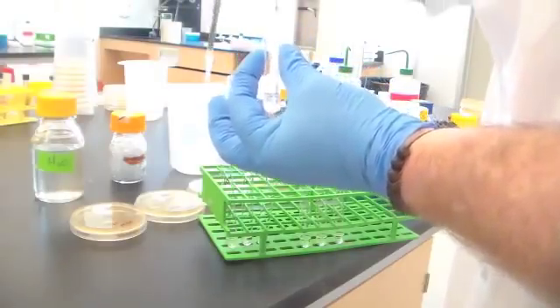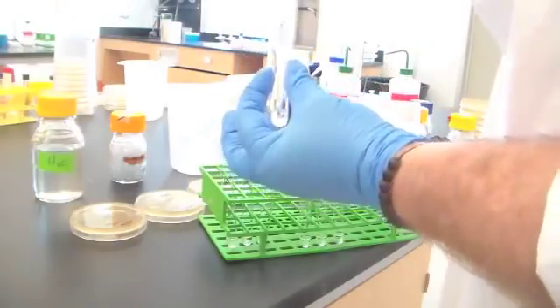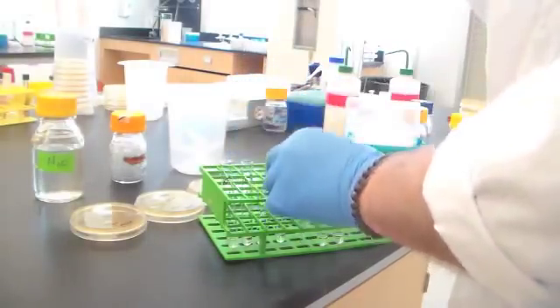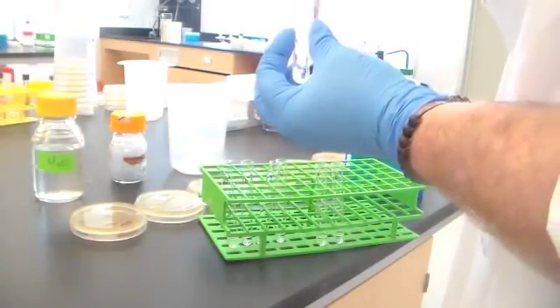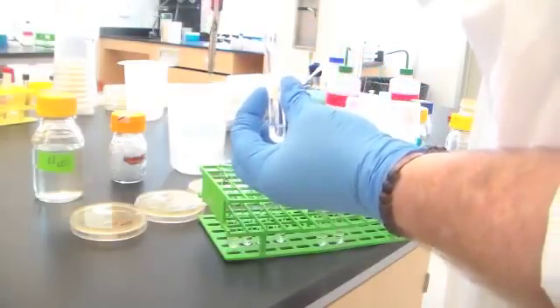There's lots of ways that you can make an error as you're doing this. So it's important to stay focused. Even as I'm talking to you right now, I'm beginning to think, have I made a mistake? Did I forget to change pipette tips? So I'm just going to do the rest of this in sweet, blessed silence.